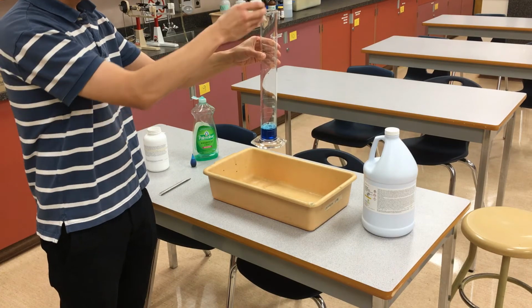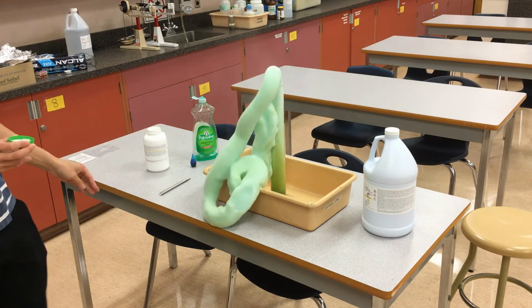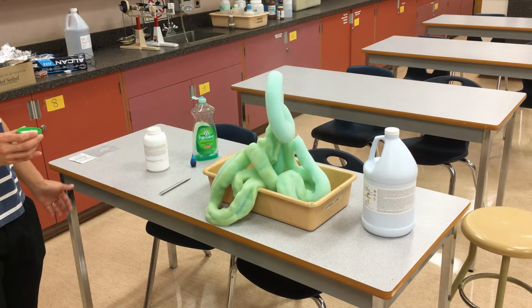So let's have a look. 3, 2, 1. Let's roll around a little bit here. And there we go. You see a whole lot of steam coming off of there, so it's actually fairly hot. It's very exothermic.